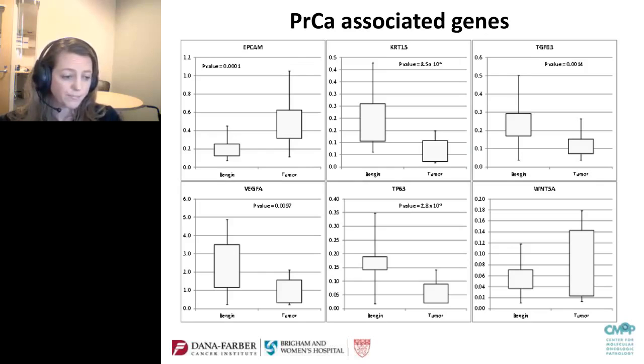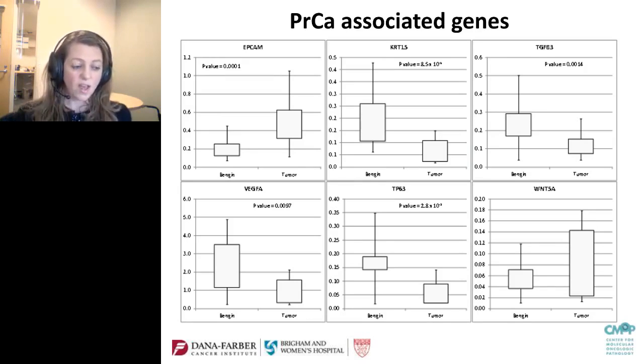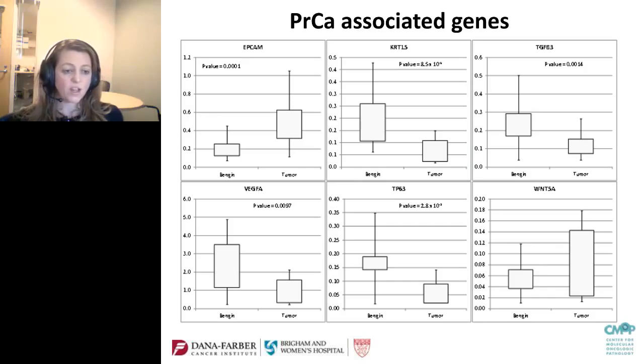Where we are with this right now is that we've just completed all the QC on these samples, and the next phase is to go back to the transcript data that was generated and the isoform data, and with confidence, use these prostate cancer-associated genes as validation to go back and look at maybe novel genes that are differentially expressed that are not included in our hallmark of prostate cancer panel, and also to look at subpopulations within our cohort.